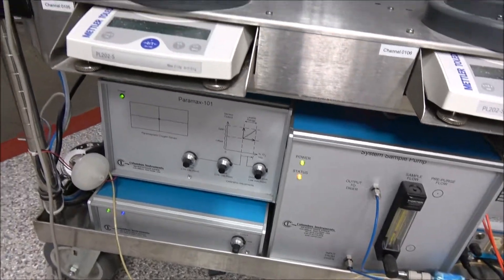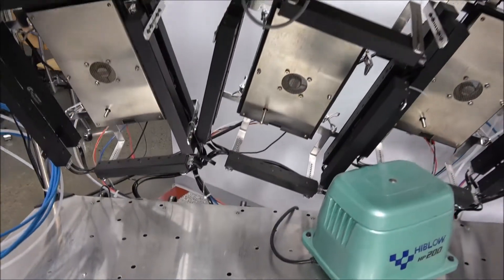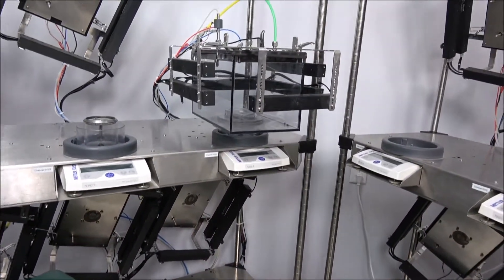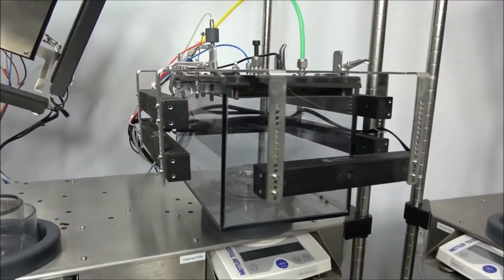There are 32 triple-axis detection sensors that monitor activity and sleep status as defined by the user in the X, Y, and Z axes. These sensors are designed to cloak the animal cage as such.